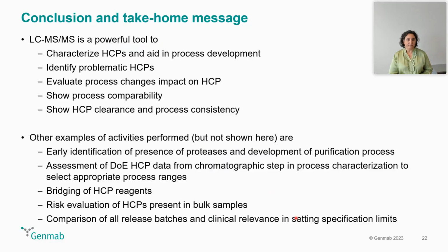We have gone further at Genmab, and we actually have initiatives on using the LC-MS for more examples that I haven't shown here. These are, for instance, early identification of the presence of proteases and the development of the purification process in order to remove these proteases.